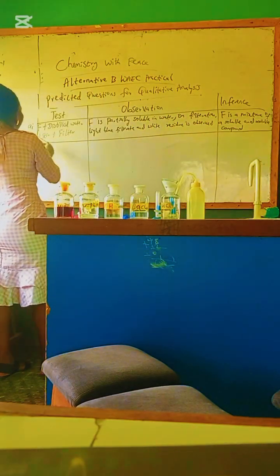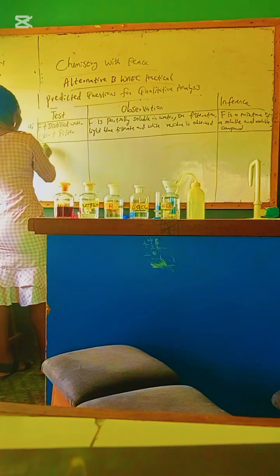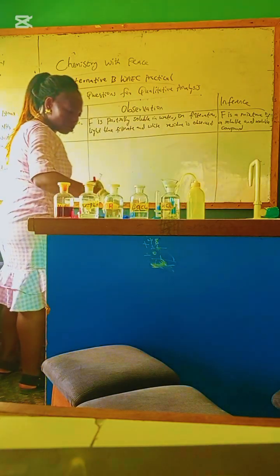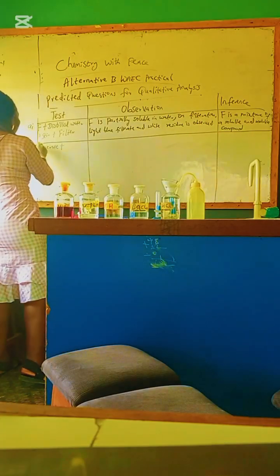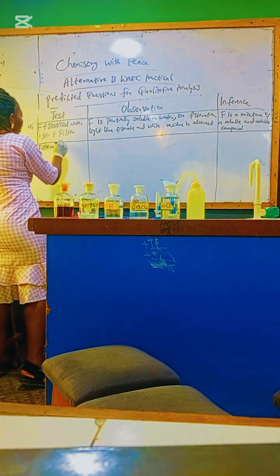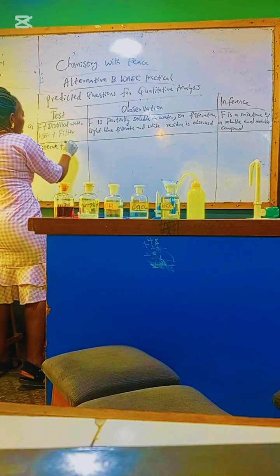So we are going to have filtrate plus litmus paper.